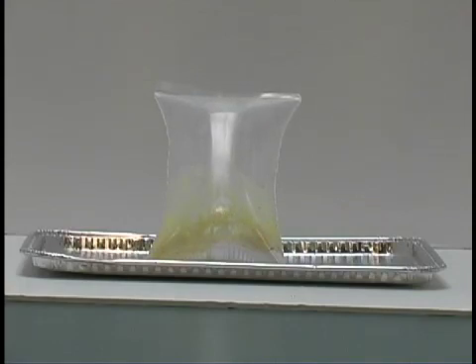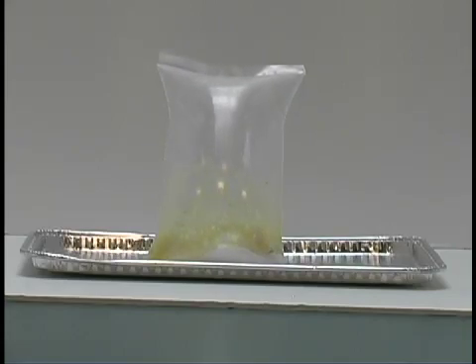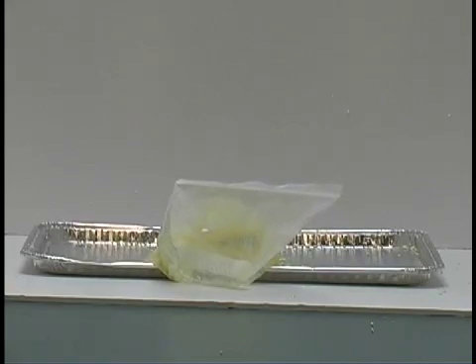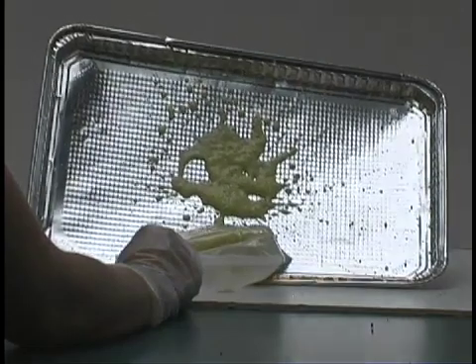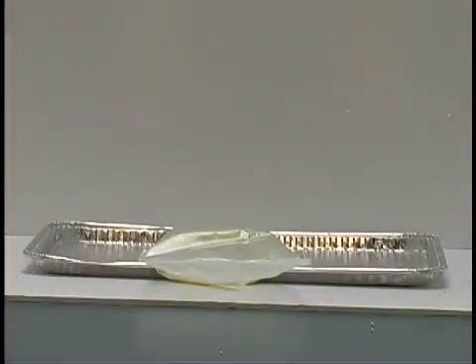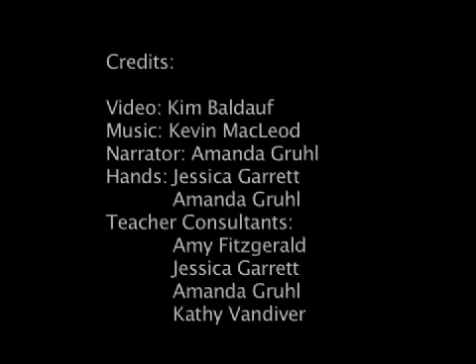This concludes the GEMS Chemistry Wet Lab. For teachers' eyes only: for safety purposes, we wanted to show you what would happen if the bag isn't opened to release the gas — exciting, but messy. We found this was only possible if we combined about two to three times the amount of reactants specified, so you shouldn't have problems with this happening in your classroom. However, you should remember to tell students to open their bags if too much gas starts being produced.